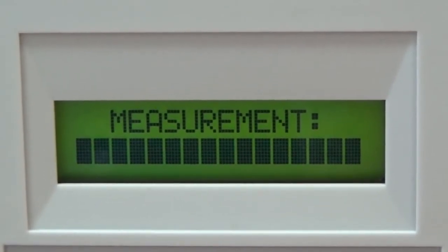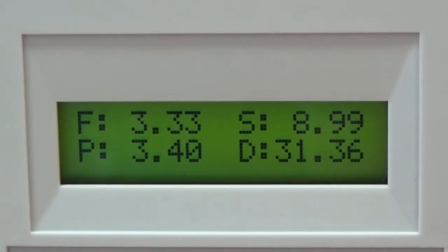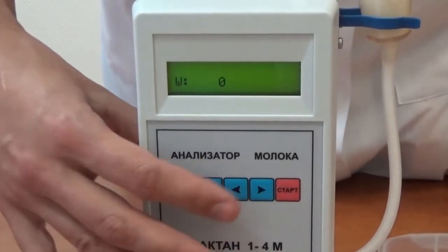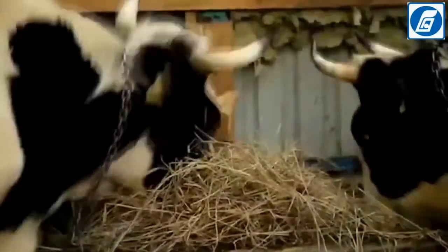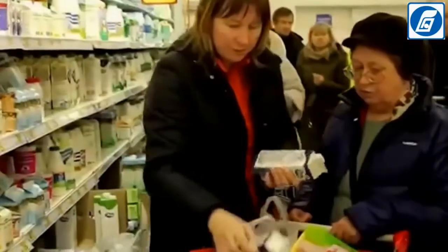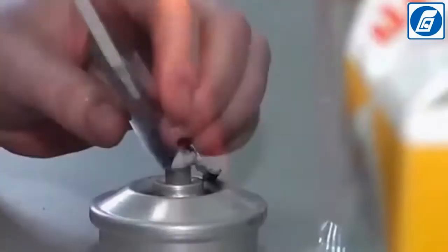The five parameters required for milk collection and assessment of its quality are: fat, protein, SNF, density, and added water. This model is very simple and convenient in terms of operation and maintenance, suitable for use in farms as well as ideal for receiving milk from private farms. The average measurement time is not more than three minutes. The analyzer doesn't require additional calibration by users, special milk sample preparation, or use of expensive reagents and sophisticated laboratory equipment.